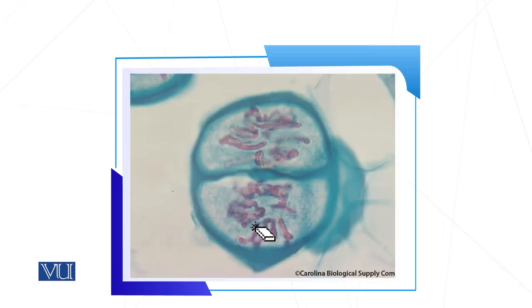In the third slide, you can see two daughter cells as a result of meiosis 1. From all the discussion, we can clearly identify the different stages of meiosis and whether they belong to meiosis 1 or meiosis 2. Keep in mind the mechanism of crossing over, recombination, and the alignment of sister or non-sister chromatids to identify these stages. I hope you can now identify different stages of meiosis in the permanent slides.